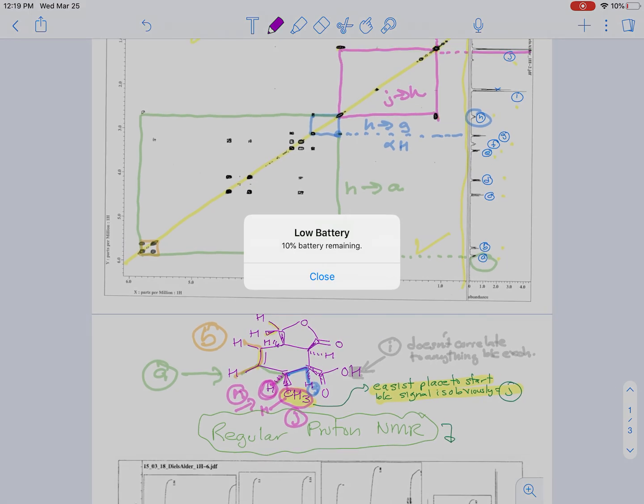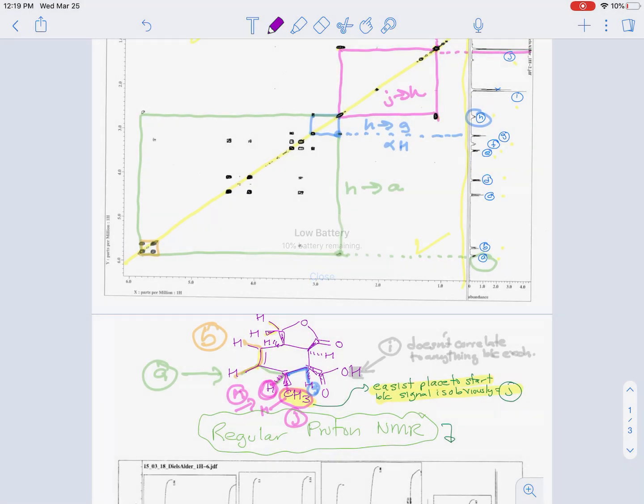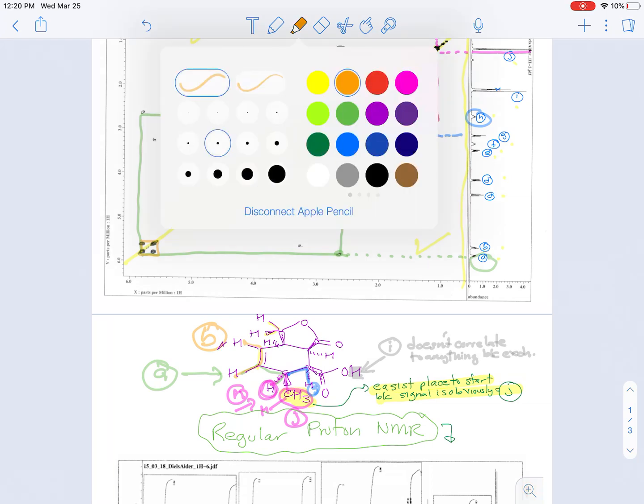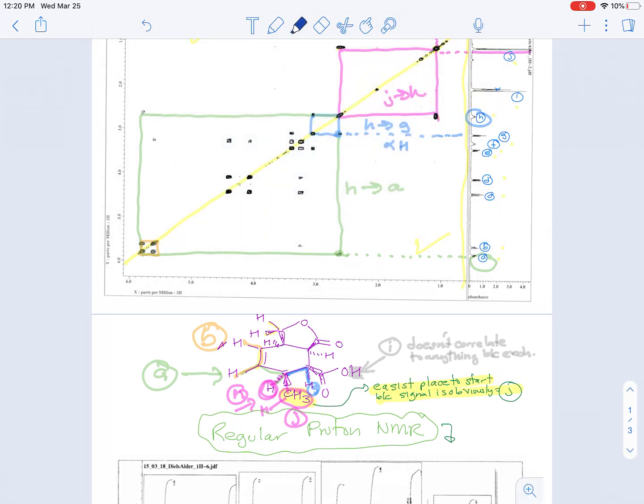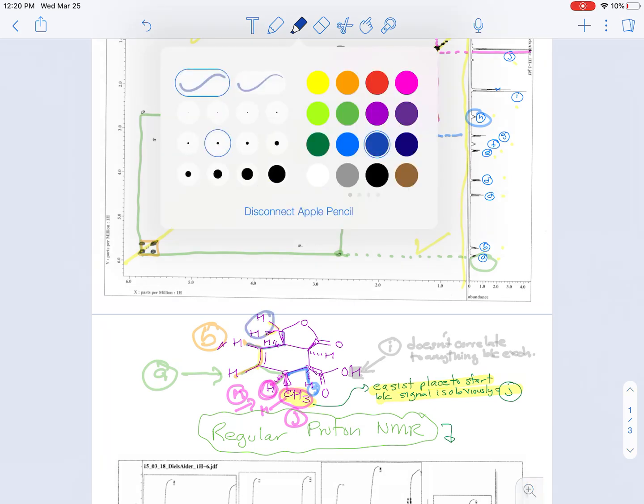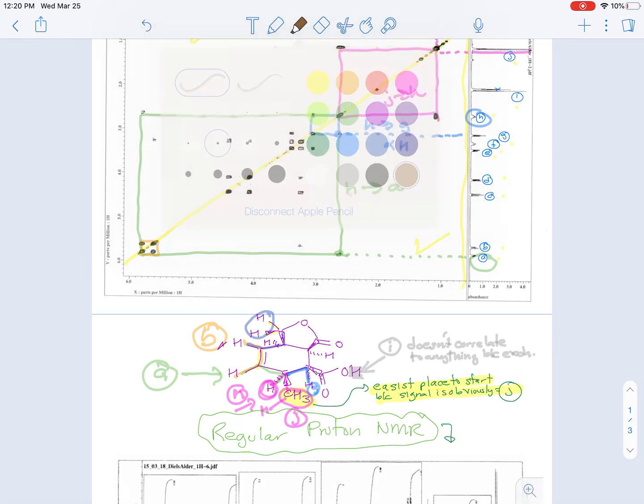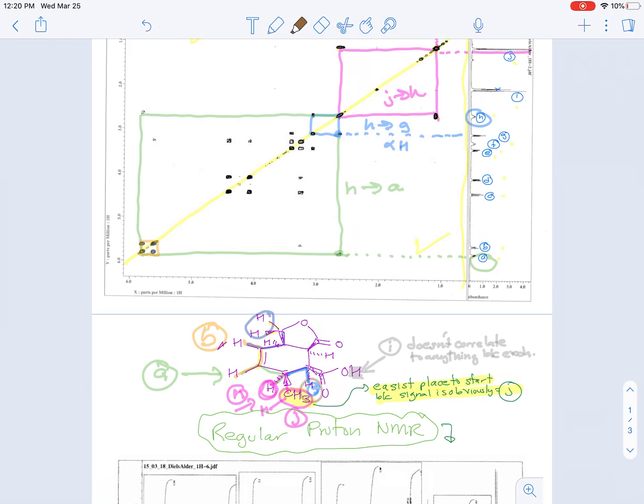And then as you keep going around, there's a hydrogen I forgot to write in here because I always forget something. So hydrogen B is going to then correlate to this hydrogen, and then that's going to correlate to these two hydrogens. And the same thing going around the ring the other way. This signal is going to correlate to this signal.